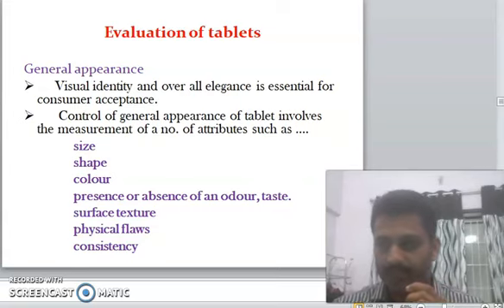When the granules are ready for compression, you have to conduct tests for the granules' appearance, thickness and diameter, hardness and friability, weight variation test, disintegration test, dissolution test, etc. Similarly, during packing, again you have to check the uniformity of the content, and also check for spillage or leakage, etc. So that depends upon the manufacturing steps. Under different steps, all these tests have to be conducted.